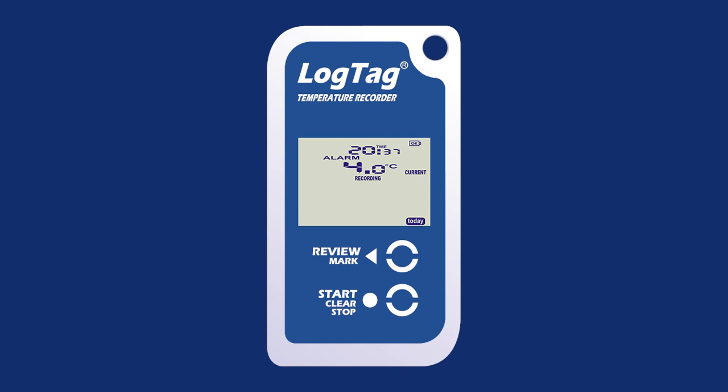Once the temperature has returned to the acceptable range but the alarm remains present, the alarm symbol will continue to display but the alarm threshold arrow will disappear. To clear an alarm, press and hold the Start Clear Stop button. The alarm icon will flash, and once it stops flashing, release the button to clear the alarm.